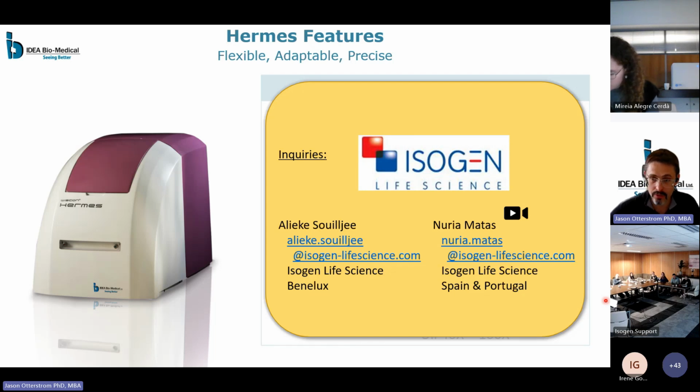That obviously decreases with experience, but I think rather it is a one-time time investment, that if you make the proper plate and the proper first experiment, that you know the outcome that you want, you can identify parameters within a relatively short period of time, we'll say 1 hour, that you can then use and repeatedly apply to any number of plates that you want in the future. So it's a one-time time investment for future replicability and with any user.